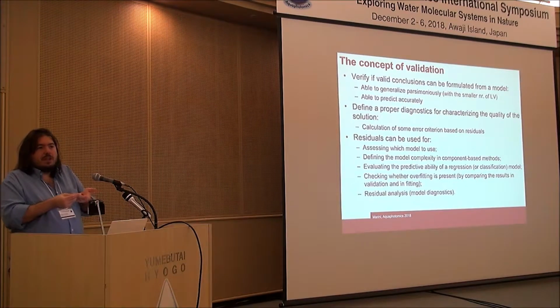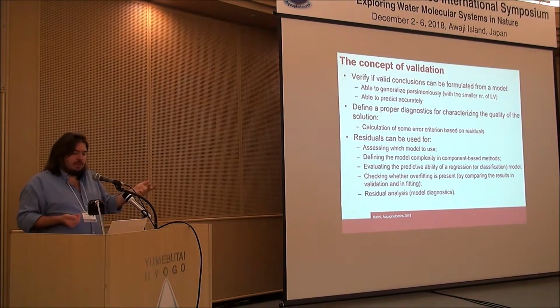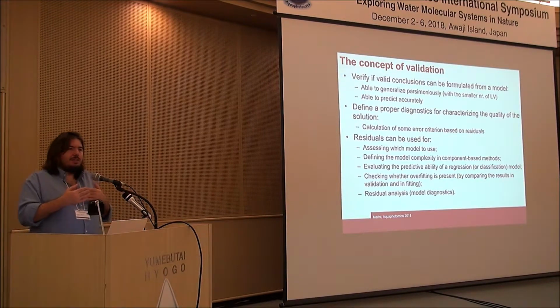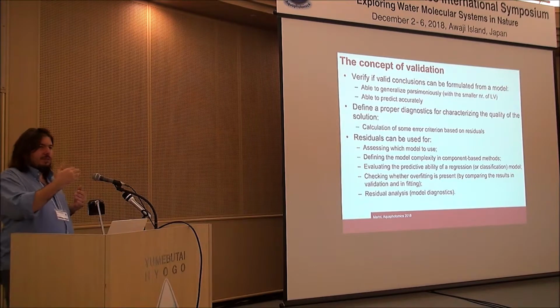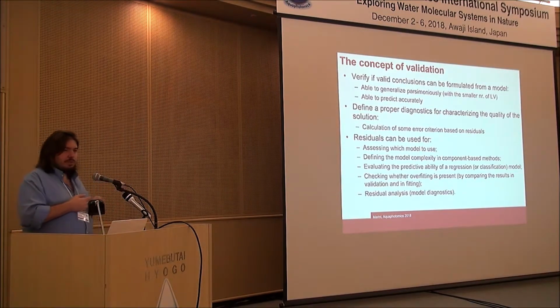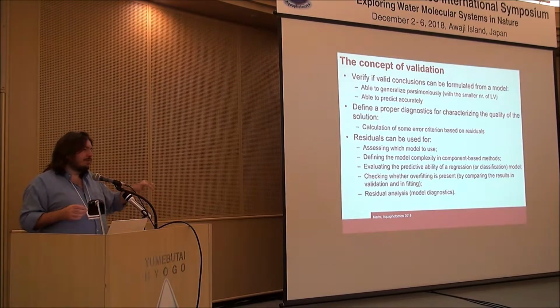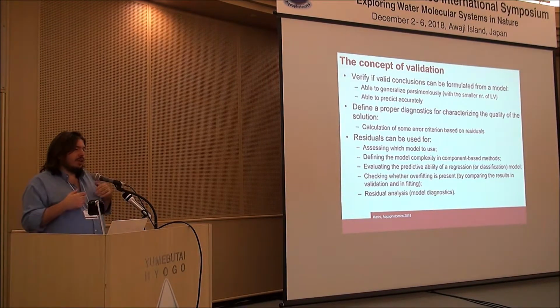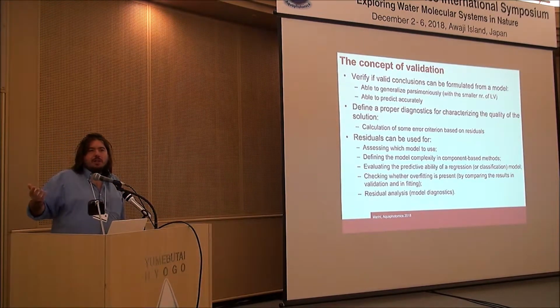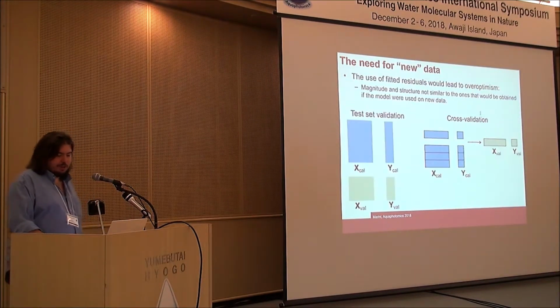Of course, since they are residuals, they may give us information about predictive abilities, but also, since we may have different entities in residuals depending on the situation, they may give us a hint about the possibilities of overfitting the data. And additionally, we may do a residual analysis to check for additional structure if we suspect phenomena that we're not taking into consideration when we are doing our modeling phase.